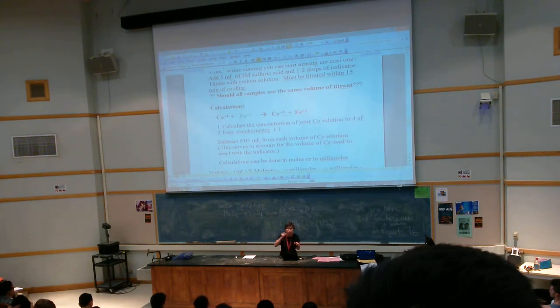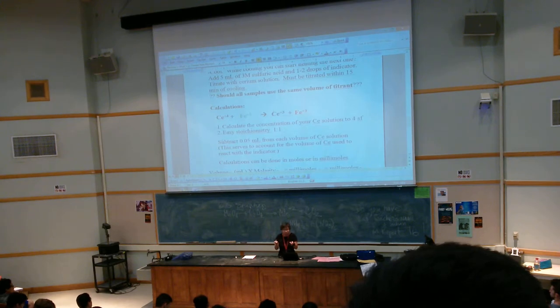So when you do your calculation, it's going to be based on the volume already subtracted by 0.05. I've had students in the past who subtract and then go back to the titrate volume. You're subtracting to correct for the indicator, since you added some Fe in there. Are you following me? Yeah? Okay, I see a few people nodding. If you don't understand, raise your hand.